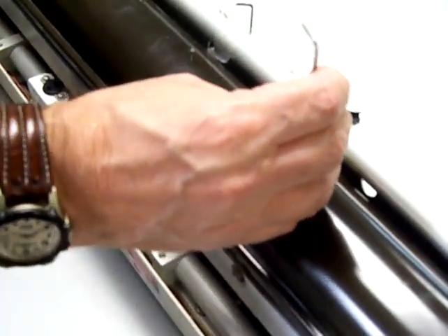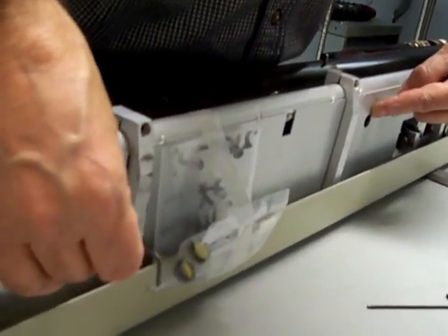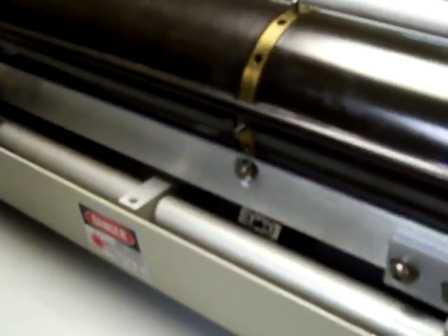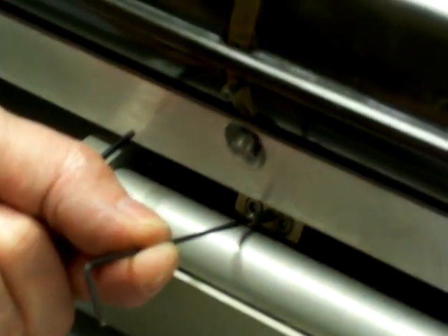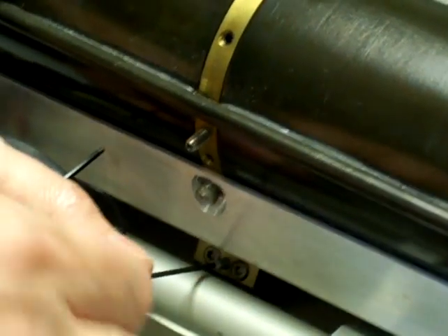And you'll also find there are 2 holes in the back of the resonator here and here. That gives you access to the side screws. And bring those out slightly as well. And there is another vertical adjuster. It's a smaller size Allen key. And the adjuster is here. And you need to just unscrew this until it's almost coming out, and then just drop it in a bit. This one here, unscrew it all the way till it's almost coming out, just drop it back again.